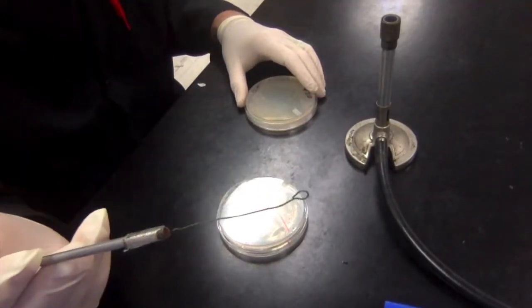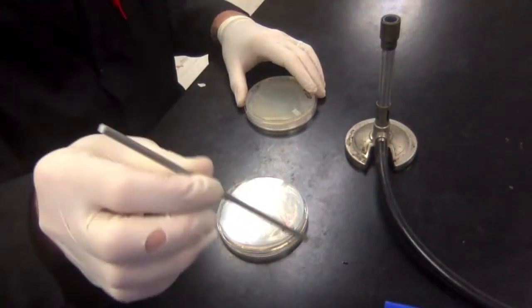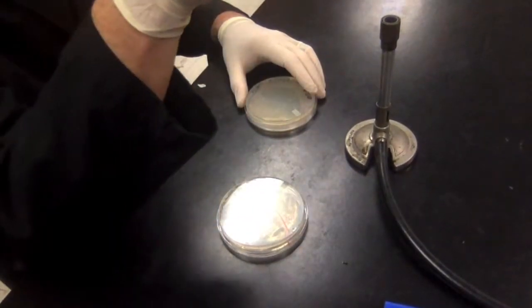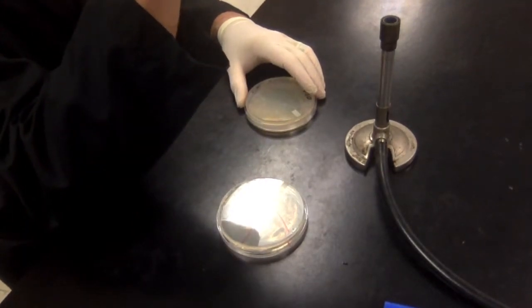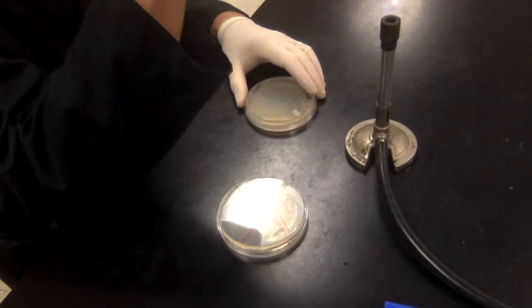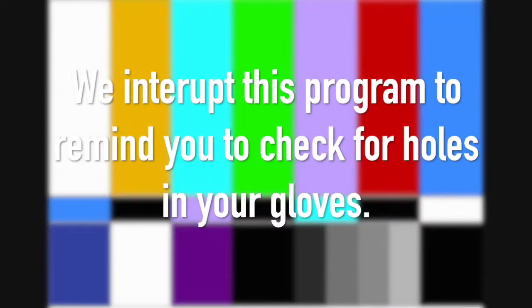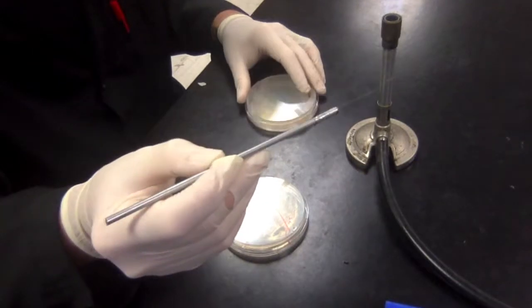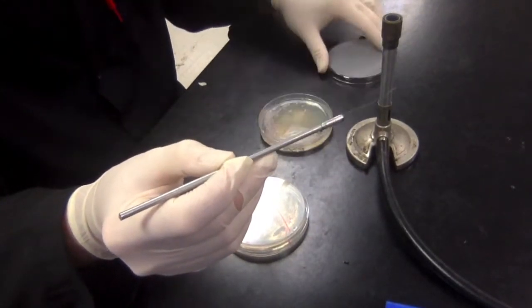I have my inoculating loop here. I'm going to hold it at a 45-degree angle into the flame — you can see it's glowing red hot. I'm going to count to ten to let the loop cool off enough that it doesn't kill the bacteria when I touch them.